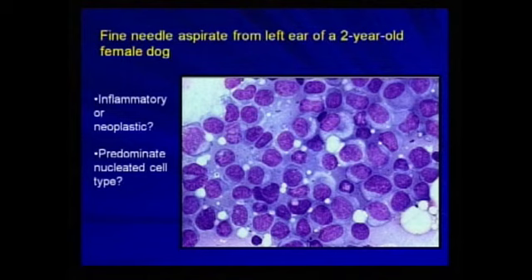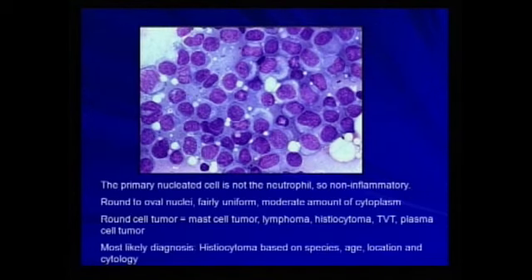Well, it's this large histiocytic looking cell. A couple of these have some indented nuclei. They all look about the same. There is some pleomorphism. Okay, if you look within a lot of these tumors, you may see some lymphocytes scattered through. Okay, this is a round cell tumor. This is what a histiocytoma looks like.